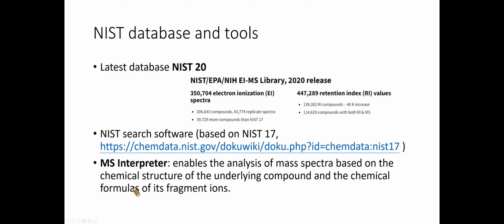The associated tool, Mass Interpreter, can find possible structural origins of peaks in the mass spectrum and provides formulas and isotopic processing utilities.